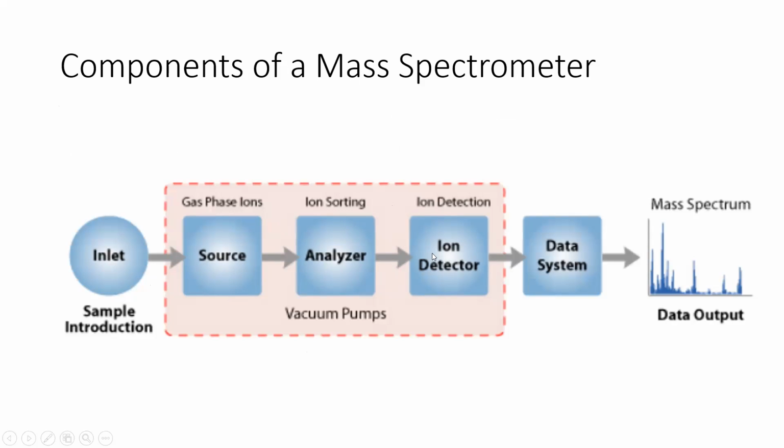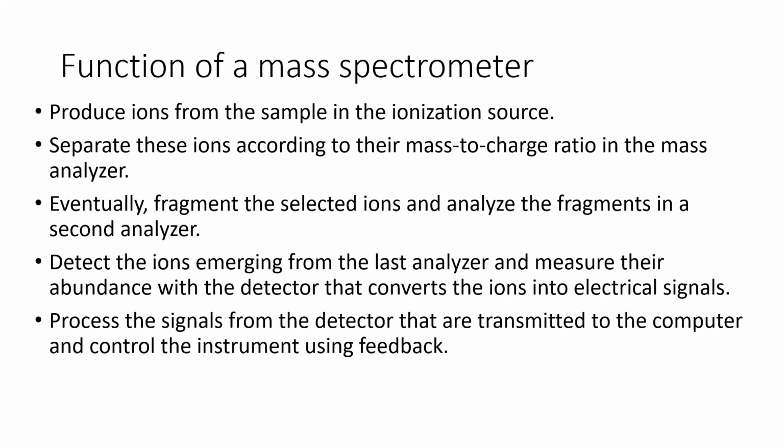So this detector detects them each time an ion reaches it, based on their mass to charge ratio. And you have the software, the data system that integrates the data, and you have your spectrum, which is the output that can be displayed on the screen of your computer and also stored in the PC so that you can retrieve it later on.